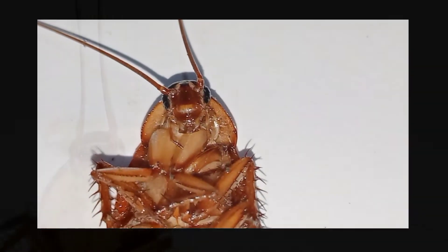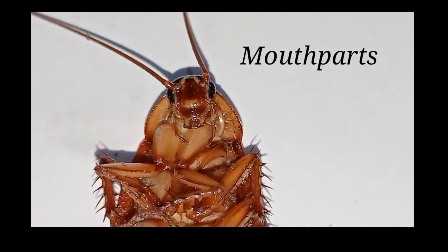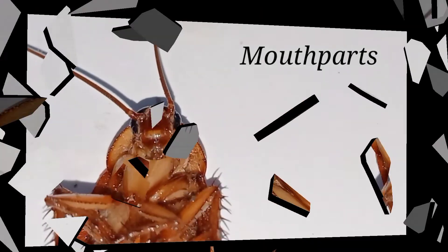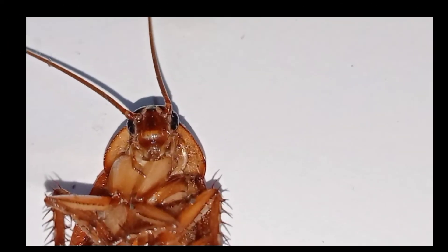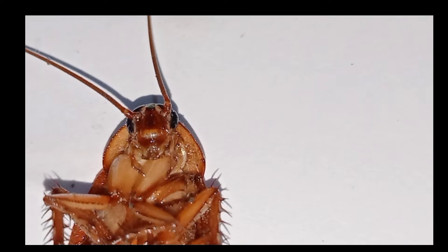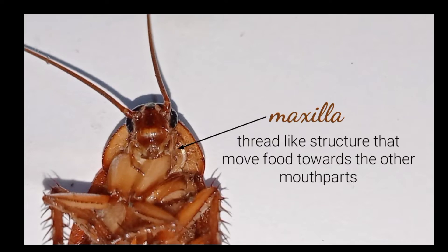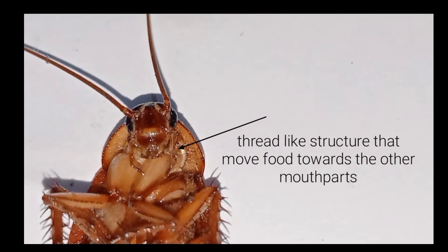There is their mouth that grinds food into small pieces. It has two different jaws. The upper jaw, called the mandible, is a strong structure that cuts and chews food. And the lower jaw, the maxilla, is a thread-like structure that moves food towards the other mouth parts.